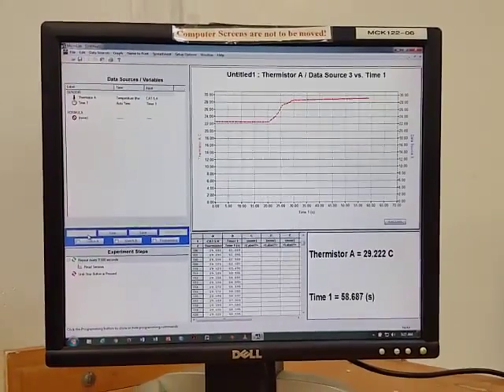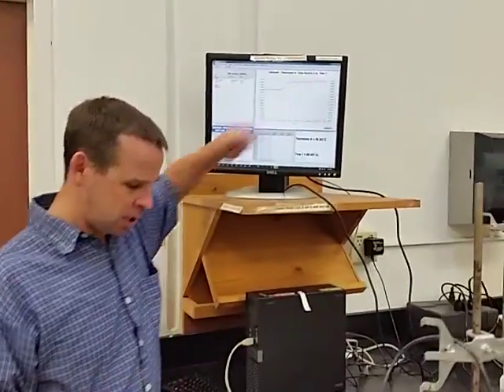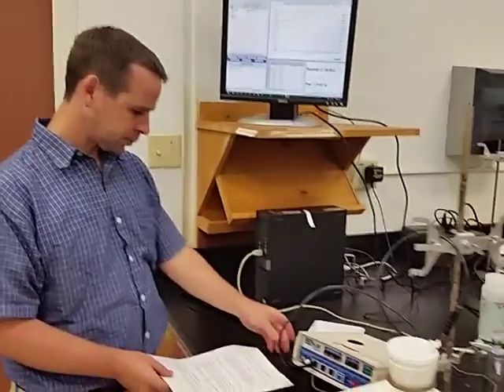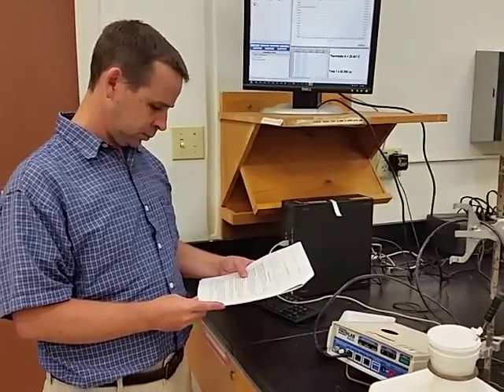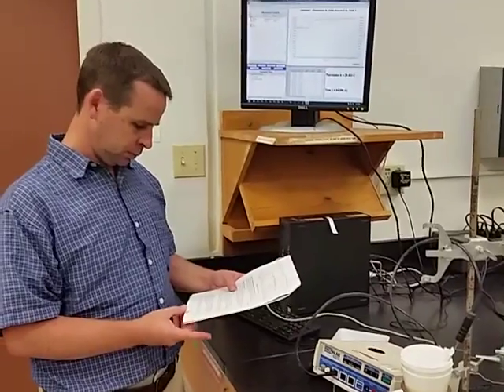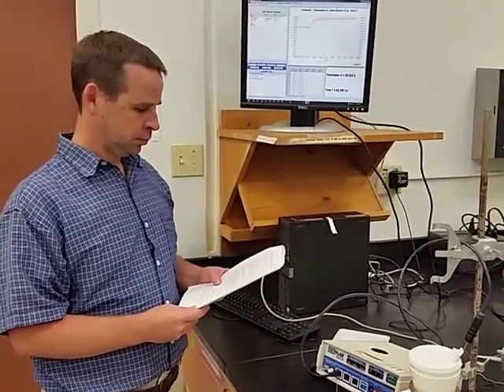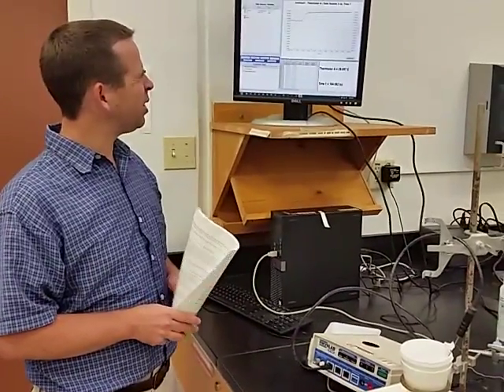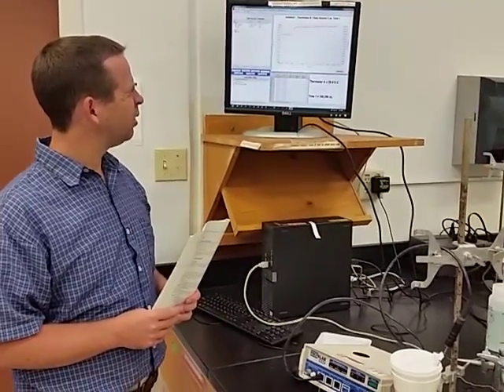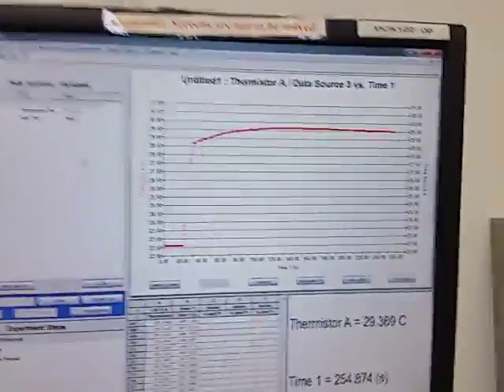All right, so we see our change in temperature already occurring there. We want to allow the measurements to continue, it says, for a couple minutes. So after a couple minutes, we'll be able to stop and identify our change in temperature. Okay? Right, that's probably, well, actually, it's still going up a little bit. We should let it go a little more. You can push pause.